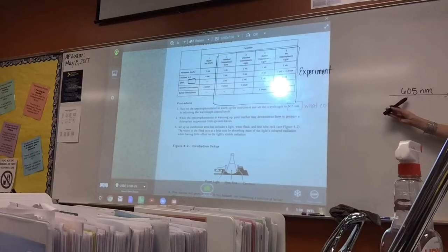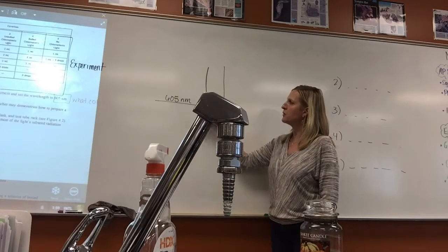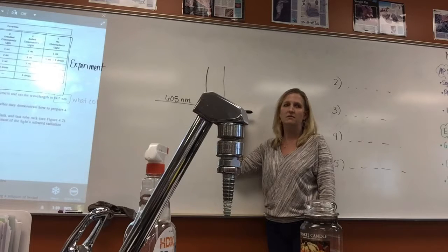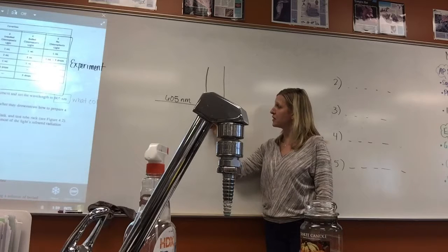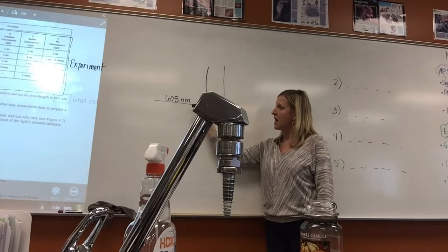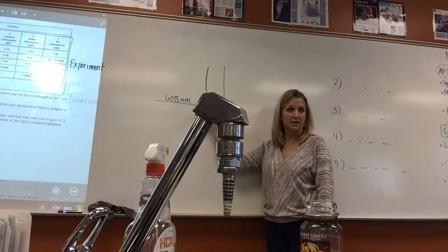Let me ask you this. If you have this light being beamed at this sample, you have solid substances. You have little chloroplasts floating around in here. These chloroplasts, as they're moving around in here, is that going to make a difference in the amount of light transmitted? Yeah. So if these guys are moving around, if the light hits a chloroplast, there may not be as much light being transmitted versus if it doesn't. All right, and so on.